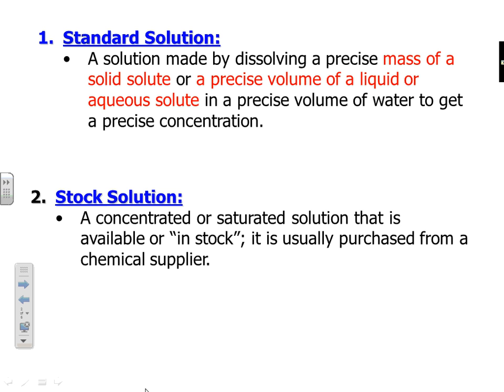So we're going to make standard solutions. Different solutions that we already possess in the laboratory prep room, we call stock solutions. They are concentrated or saturated solutions that are pre-made that we can purchase at a known concentration. Typically, we take a stock solution and dilute it. That's tomorrow's lesson. And like I said, today we're going to take some mass of a solid solute and dissolve it in some water to make a standard solution. That is today's lesson. Now, it's all about measurement.